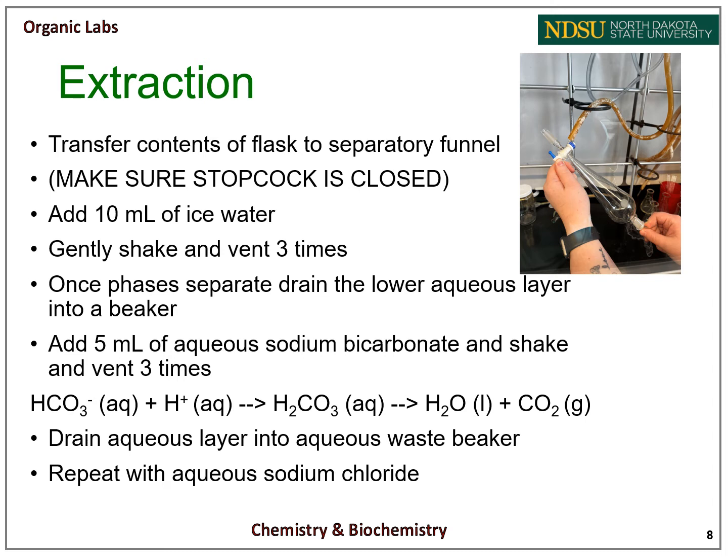The aqueous layer will be comprised of water. Unlike in the caffeine lab where the aqueous layer was on top, it will be on the bottom layer this week because it is the more dense solvent.